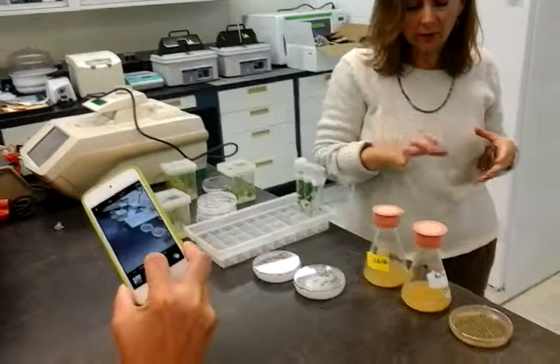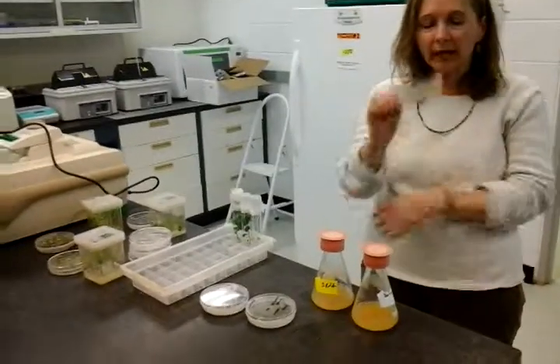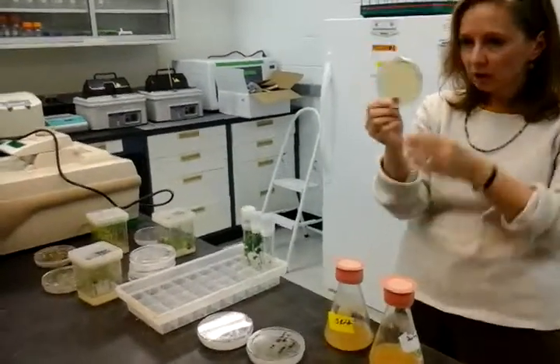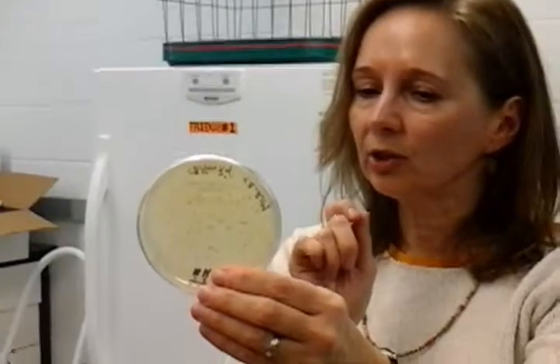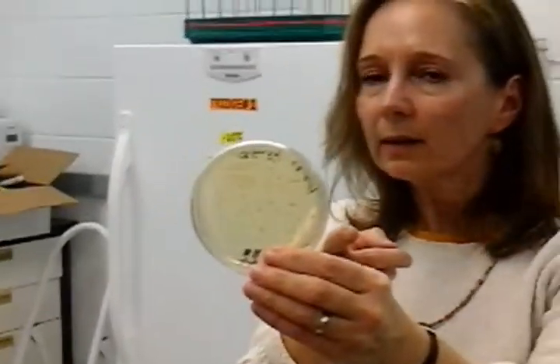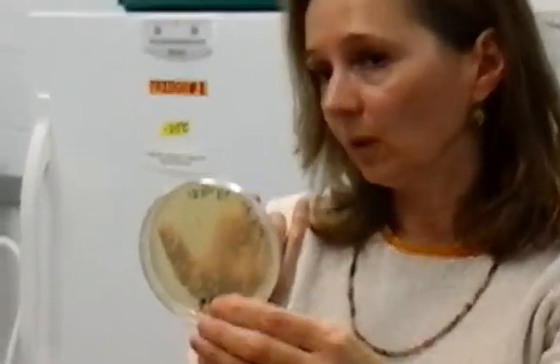We start with agrobacterium, and we do that to take the plasmid DNA and electroporate it into the agro. This is what it looks like after we do the electroporation. On the backbone of that plasmid DNA, there's also a selection agent for the bacterium. So when we plate this out into the medium — say the selection for the bacteria is kanamycin — we'll put kanamycin in the medium so that really only the transformed bacteria would grow.